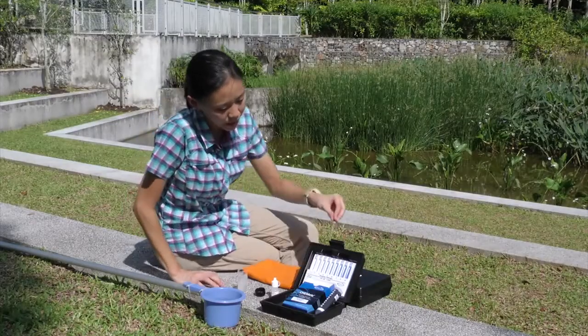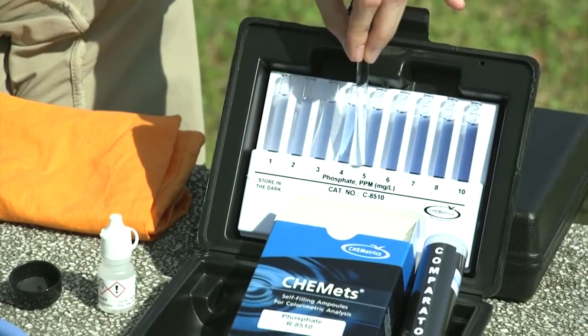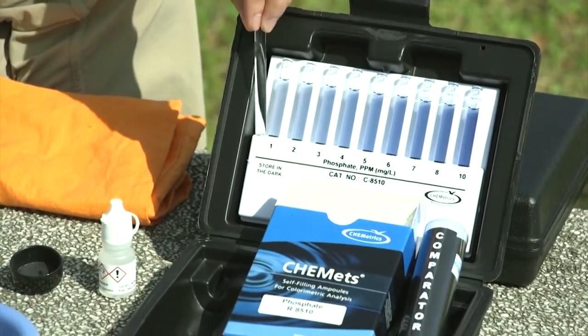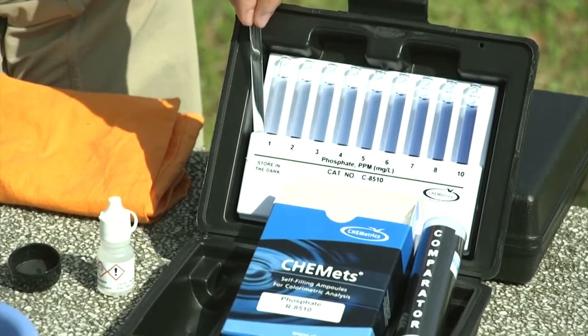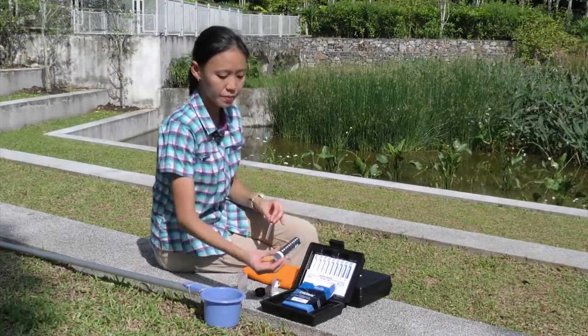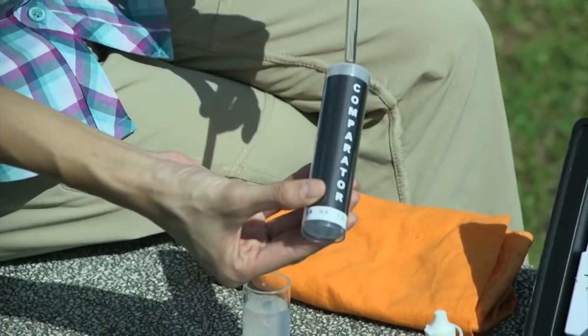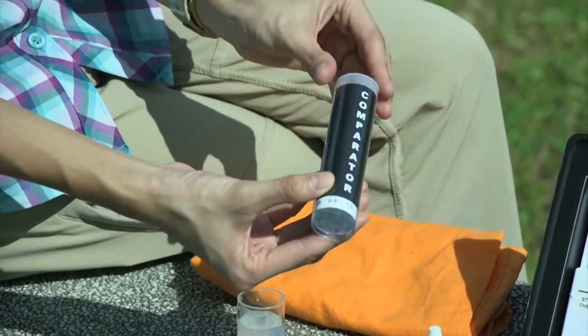To obtain a test result, use the appropriate comparator. If concentrations are high, use the regular colour standards by placing the ampule in between the standards until you find the best colour match. In this case, we can see that the concentration is less than 1. For low concentrations, use the tube comparator by placing the ampule flat end first into the comparator.